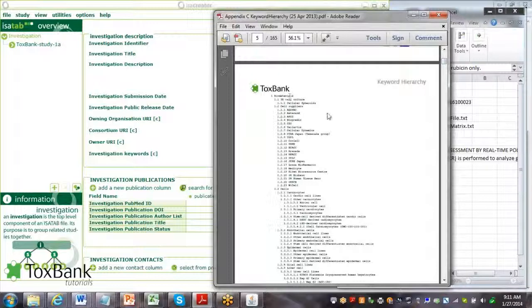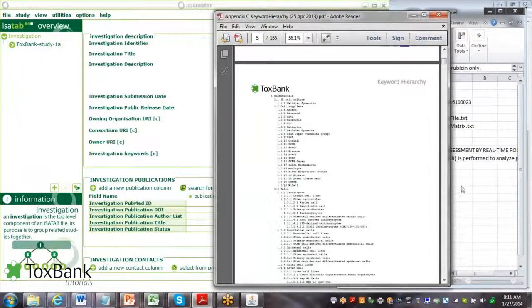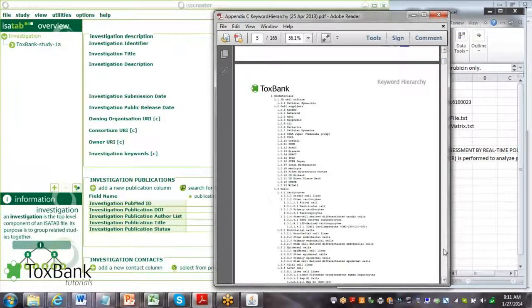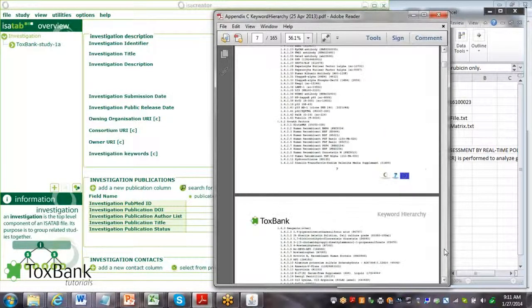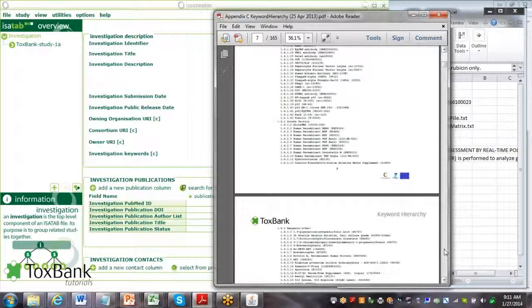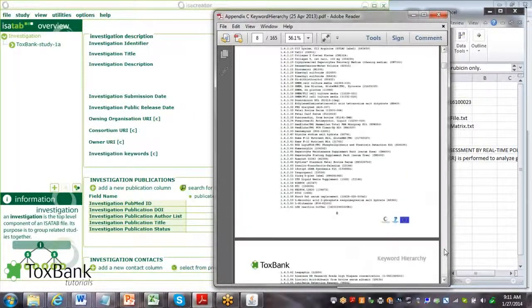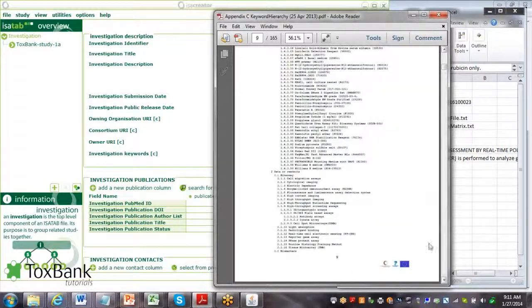Biomaterials - different cells, reagents that we used in the experiment, organized by cell lines, reagents, growth factors.